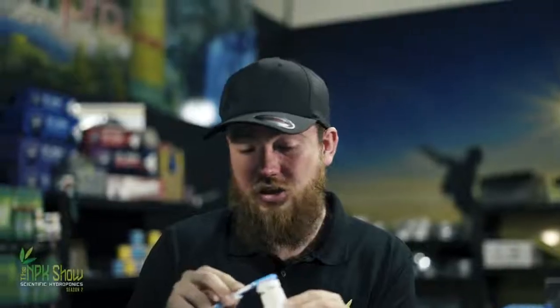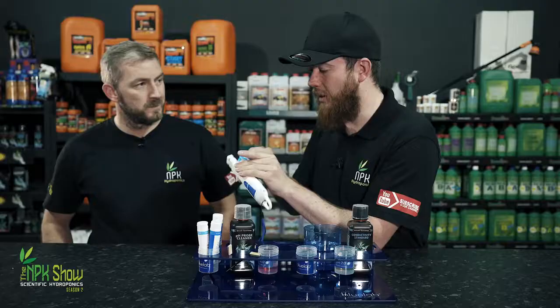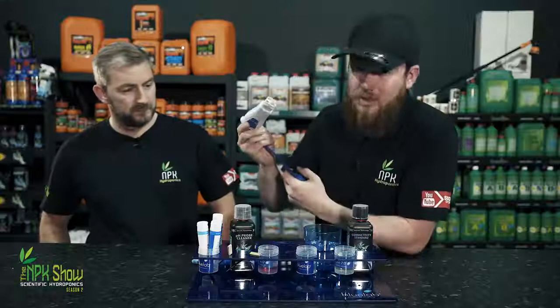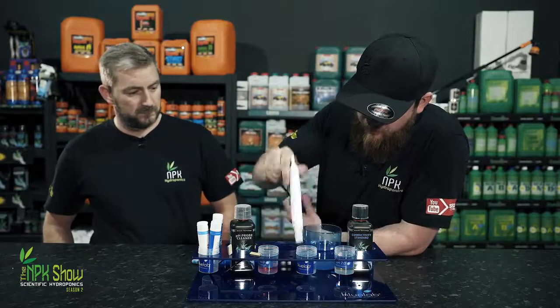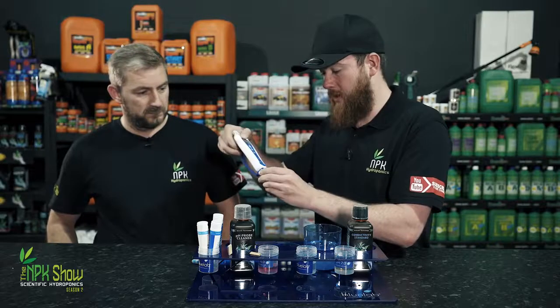So just give that a little clean. If you look after your pieces of kit, they'll look after you, and they'll last twice as long. If you abuse your pieces of kit, even with Bluelab, they will abuse you, and they will last only 6 months. Once that's been cleaned, give it a little rinse, back in the water, make sure your cap has got storage fluid in it, and that's you done.